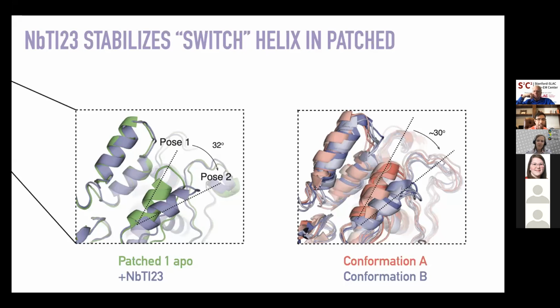So I think I actually have done that specific experiment that Sung-Soo Yu is asking for at some point in graduate school. And I think that the answer is yes, you actually can form a complex even in the absence of an agonist. It's not a very stable complex, but it can be formed, and probably if one really desired to image it, it probably could be imaged.